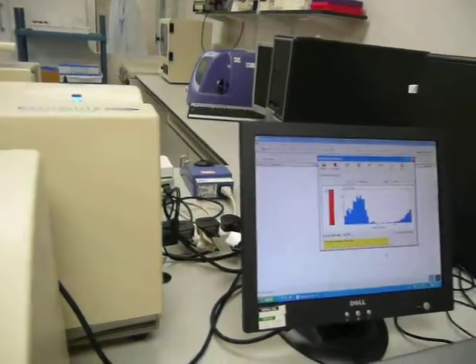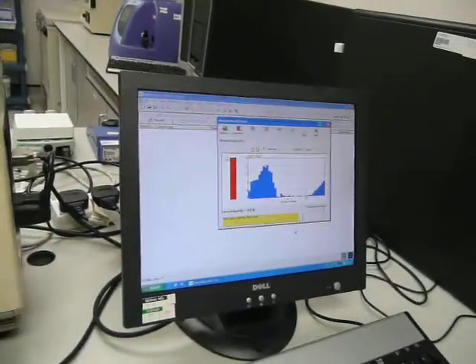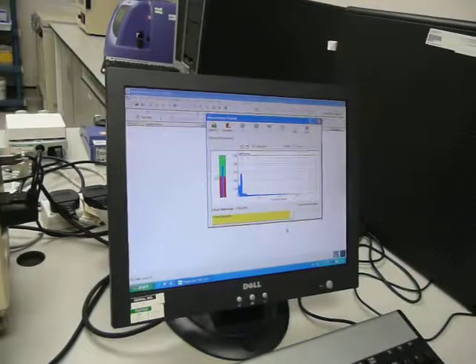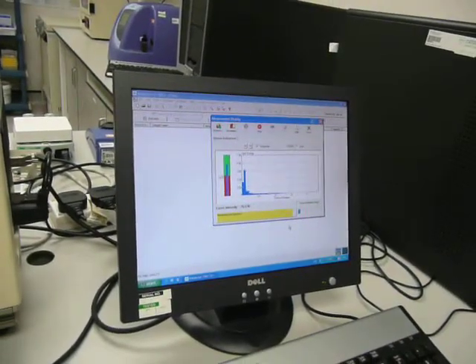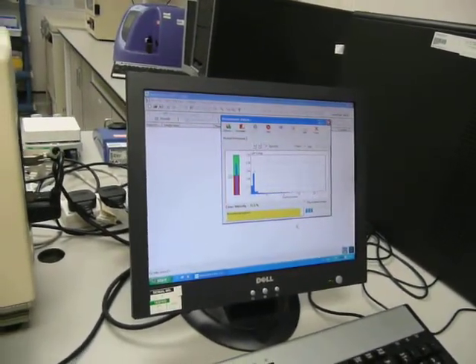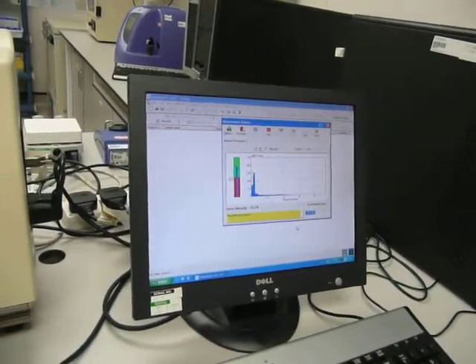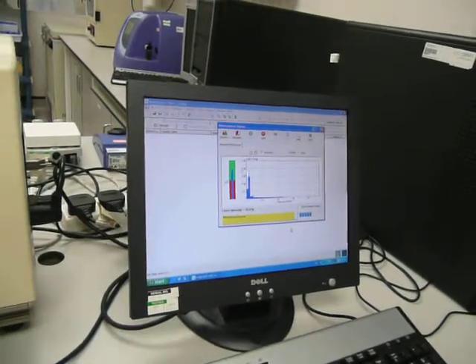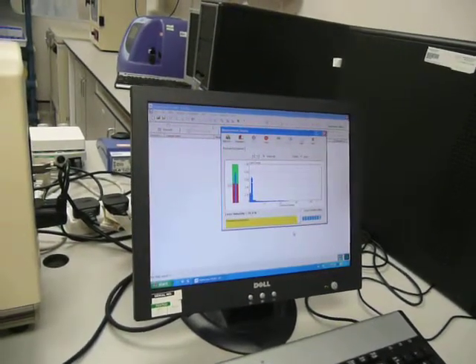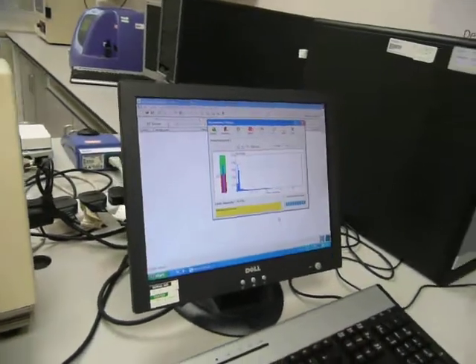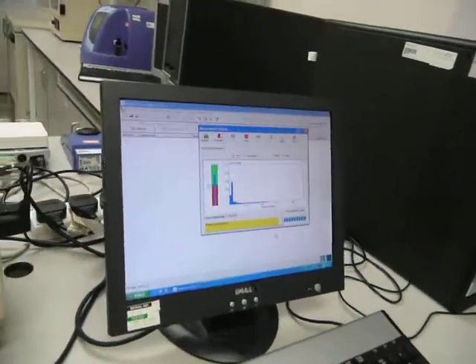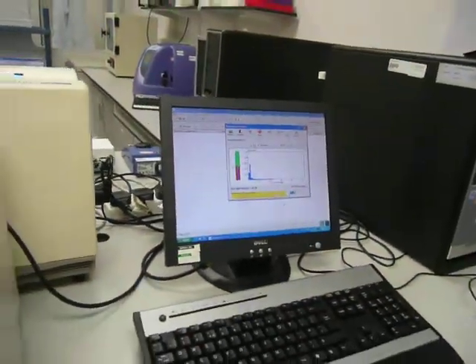And what you see there is what it's seeing. That's another laser. There's a red and a blue laser. So I can use these. I think it's set on, it's measuring bell grime at the moment. So it's actually measuring these? Yeah, it's measuring the background of water. Get everything ready.